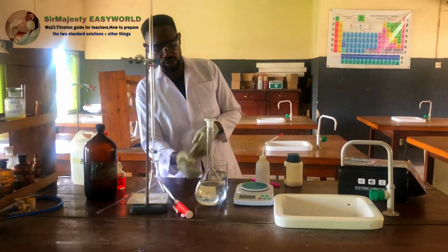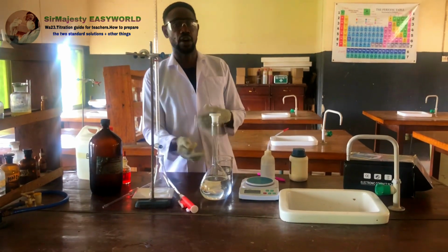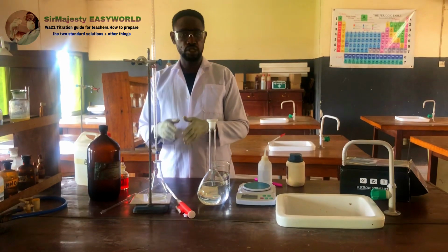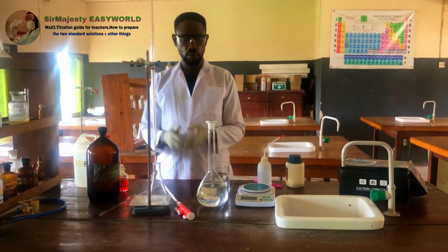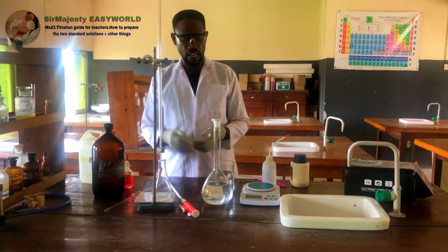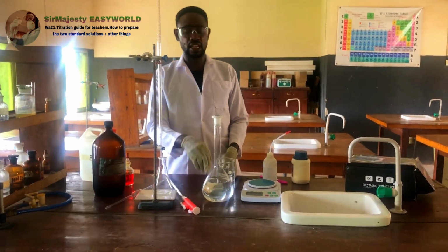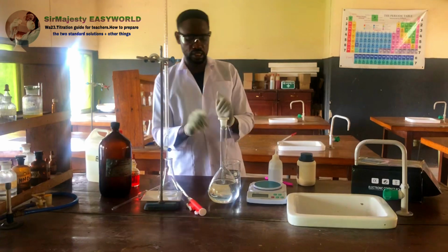So that means both the solvent and the solute will sum up to 1000 cm3. Not that you should use the solvent to make up 1000 before adding the solute. No. The HCl here is serving as the solute. So both the volume of the solute and the volume of the solvent should sum up to 1000. That's why you should not fill to this. Just fill to any certain volume and add that 8.5, then add up with water till that mark.